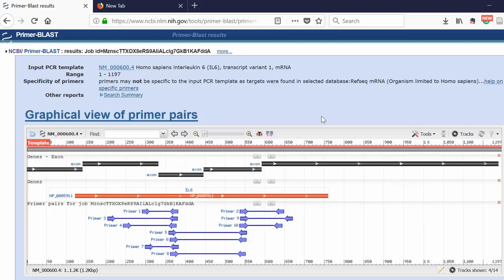So how do you know which primer pair to pick? Well, there's quite a lot of parameters you should take into account when you're looking for a good primer pair. I'll go over these in another video.